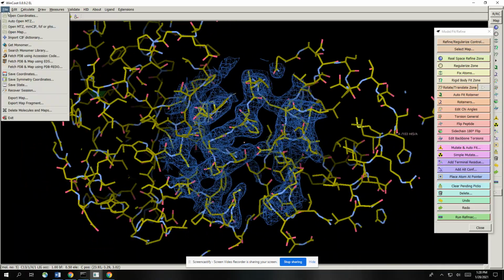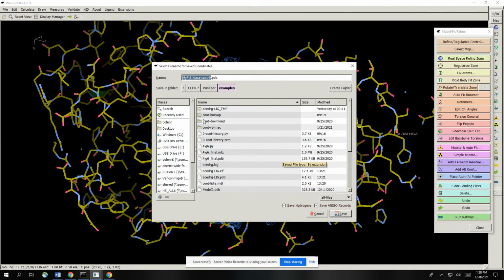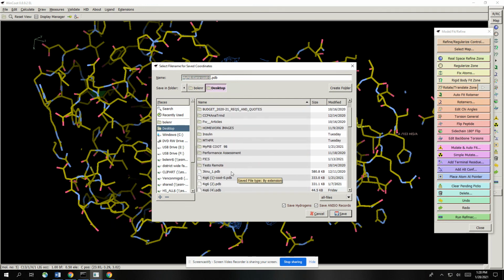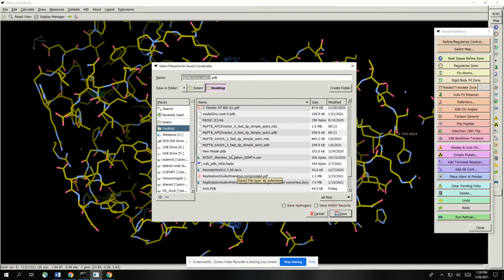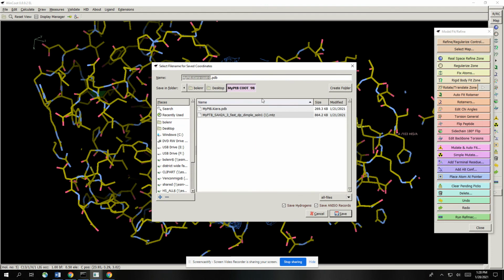So when you save this, we're all set. I'm going to change the name to merged.